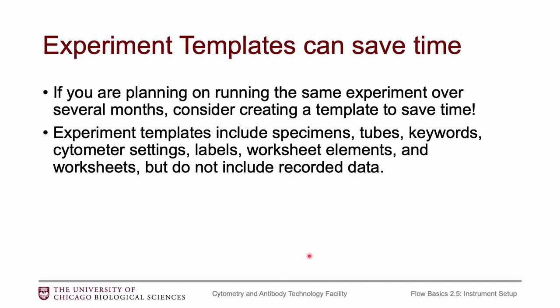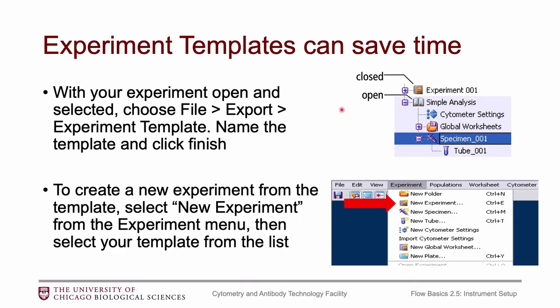Once you have all of that set up, I recommend creating an experiment template if this is something you'll be running repeatedly. You can generate a template by right-clicking the experiment or going to file export to export the experiment template. There's a little wizard — just click through and name your template. When you want to start a new experiment using the template, go to the experiment menu, select new experiment, and a window with your template list will open. If you have any questions about anything I've discussed while sitting at the cytometer, feel free to grab any of the staff for help.